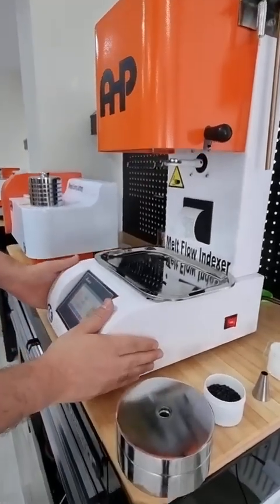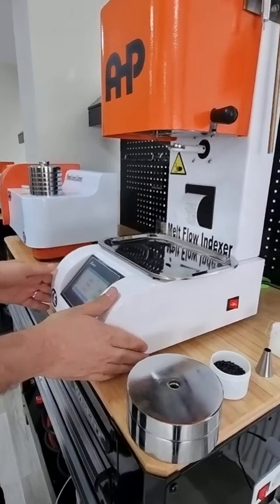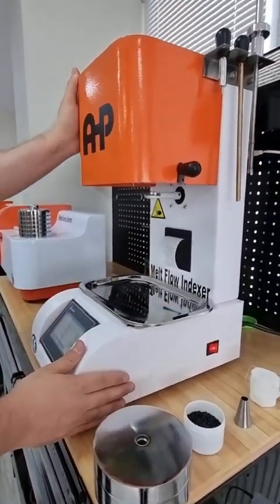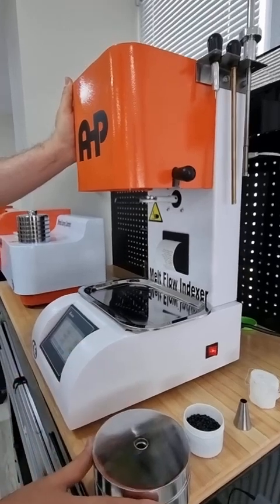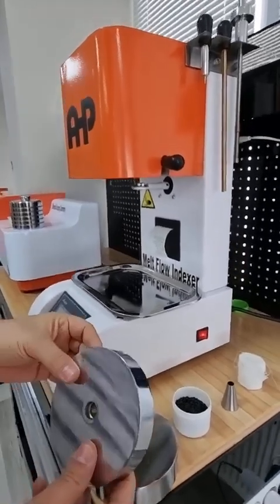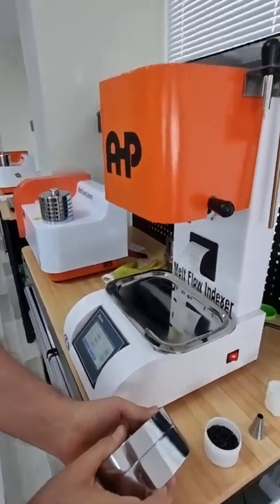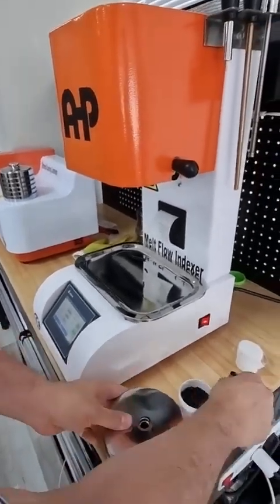In this short video, I'm showing you how to use the melt flow indexer from AHP Plastic Makina. This is the basic machine from AHP Plastic Makina, coming with two weights — the first one is 2.16 kg and both together are 5 kg.